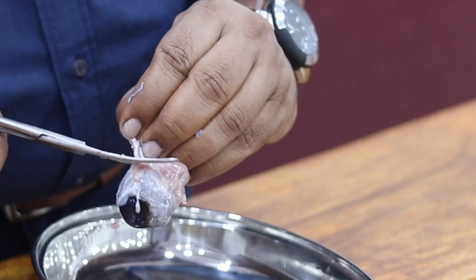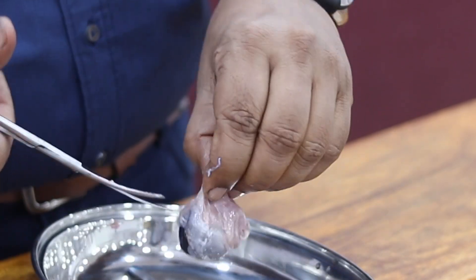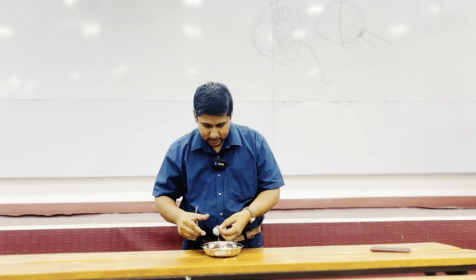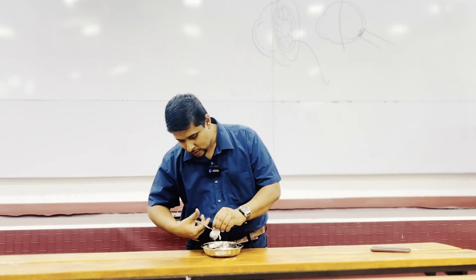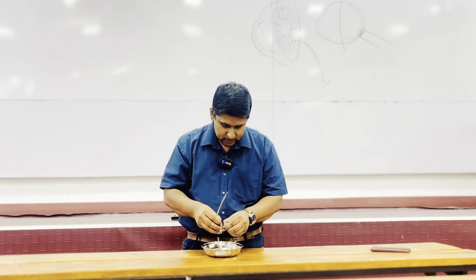These extraocular muscles are important for the movement of the eye — the eyeball movement. In the human eye there are four straight muscles available in each eye, and then two oblique muscles. They are important for the rotation of the eye.